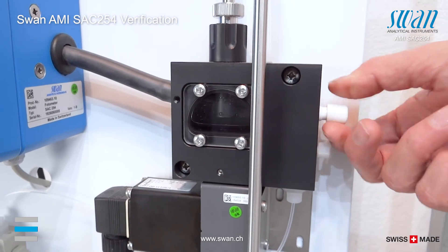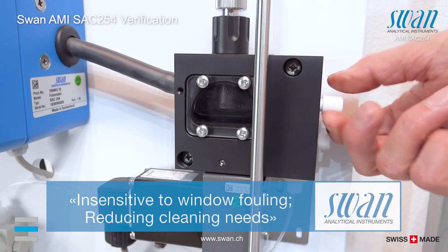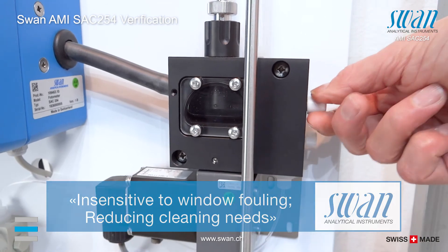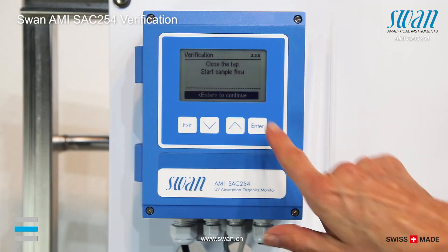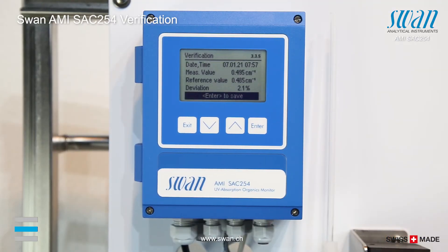Close the tab. Start sample flow. Press ENTER to save the data in the verification history.